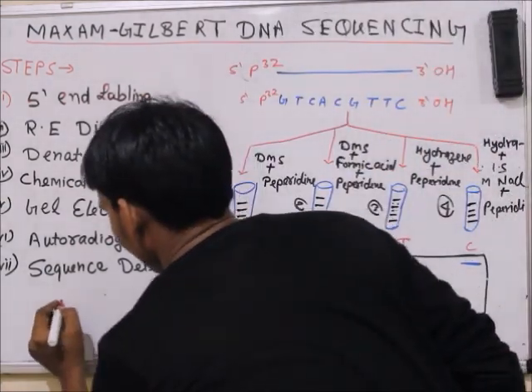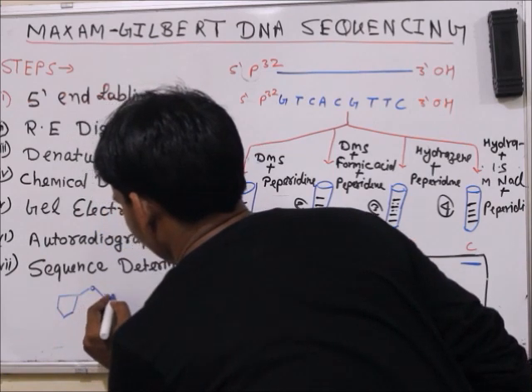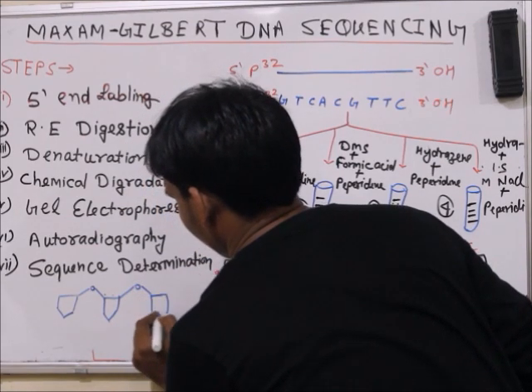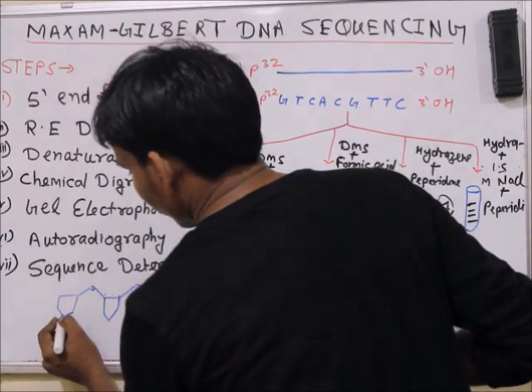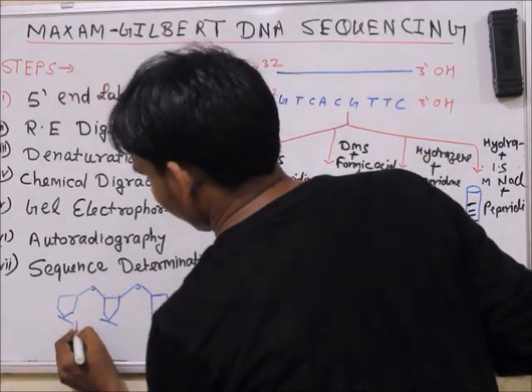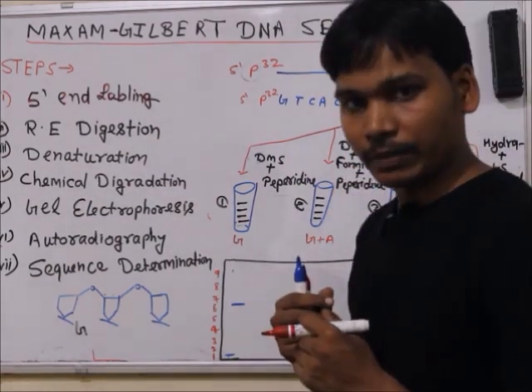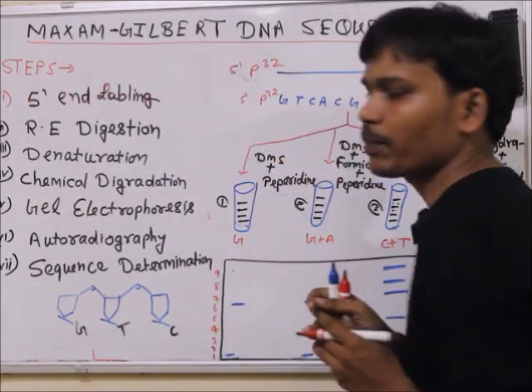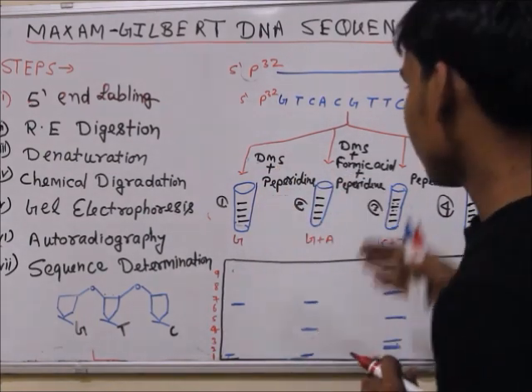There are the sugar bases. Then the nucleotide is added in these forms by the glycosidic bond. What is that? It is G. You know that there are purines and pyrimidines. Purines are adenine and guanine, but pyrimidines are thymine. Then that is G and T, and further C. This is a simple example for your understanding of how DMS, piperidine and different chemicals digest the DNA sequences.